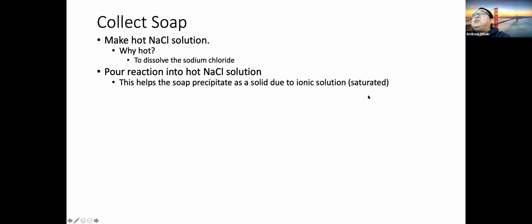Okay, I had to do this a lot when I was in the lab, because I didn't want to evaporate water. It's very hard to do, and it's not very easy. So this method was particularly useful in certain physical transformations.